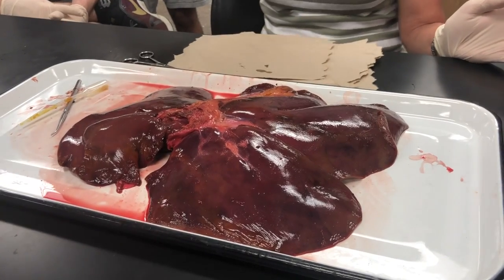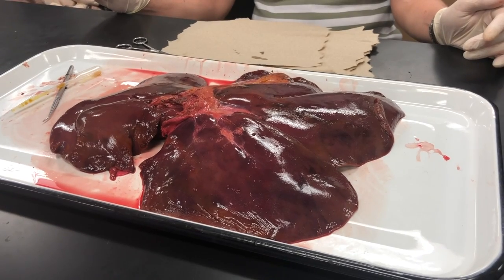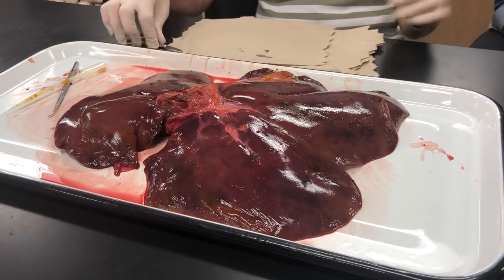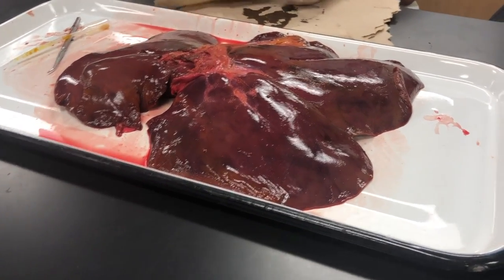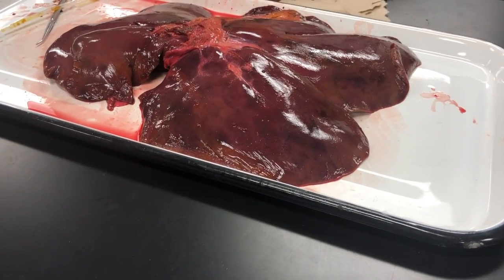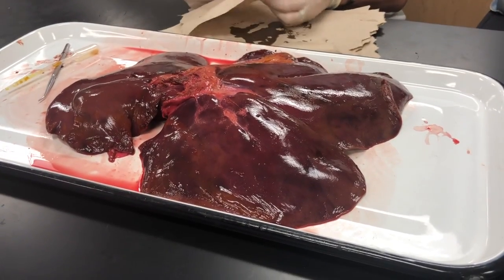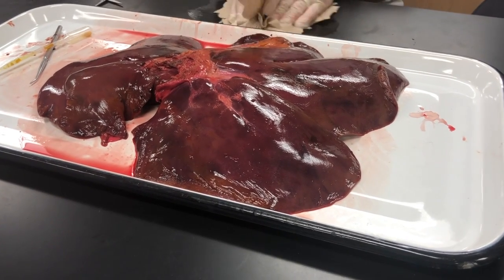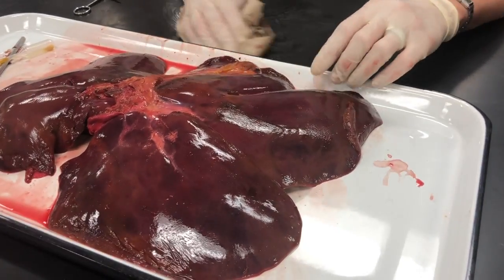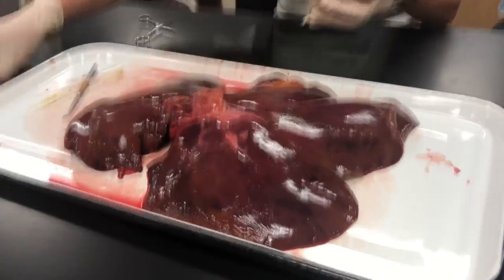Okay, remember this is what it looks like with no bile. And what we're gonna do is I'm going to let that sit, and I want you to look at it a little bit later and see what it's doing. Feeling emulsified? Yes, we are. All right, so what I want you guys to do is go back and try to find those things on your liver.